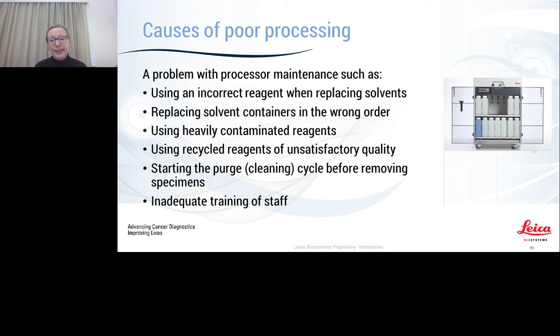Some people do make a mistake and purge, start the cleaning cycle before they've removed the specimens. While never ideal, it can be recovered, but just really make sure that there are adequate processes within your laboratory so that this doesn't happen. Inadequate training of staff. Often the people changing the tissue processes are not well trained on just how critical the tissue processing is to the overall workflow. So make sure that they know how important their job is.